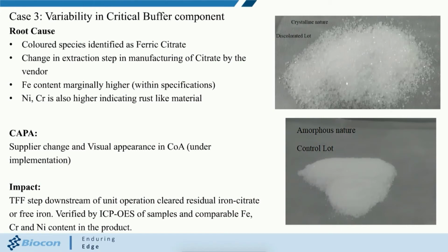So the overall conclusion I would like to communicate to you is that controlling the raw material and consumables is very critical in the process because it has huge ramifications and implications in the manufacturing process. You need a lot of resources and a lot of money to investigate issues. What I recommend, when you do this kind of biological process, is to ensure proper vendor selection through multiple vendor selection procedures so you get a quality product, and to have adequate testing procedures to make sure that you don't get unacceptable variability between lots and batch to batch.